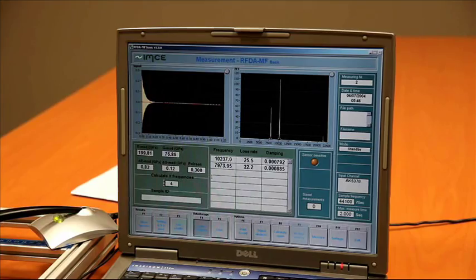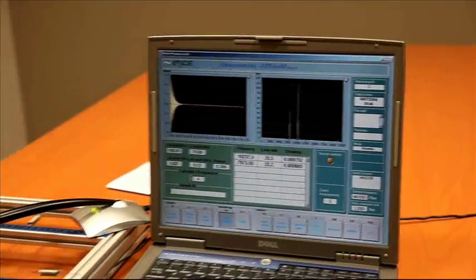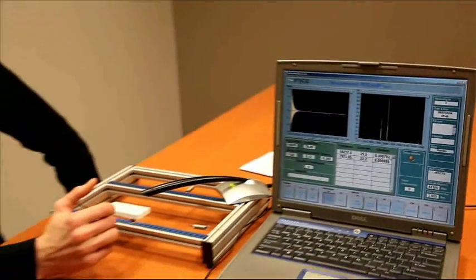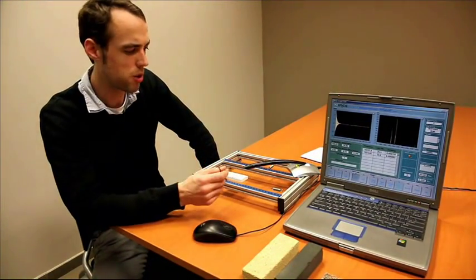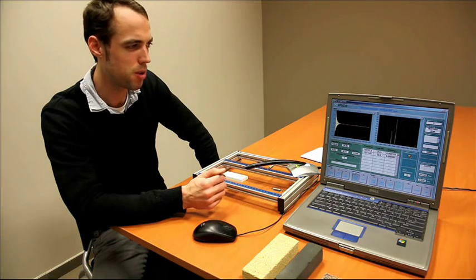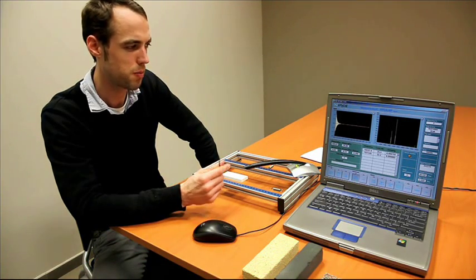The RFDA basic system is a very efficient and fast way to measure the elastic properties of samples.